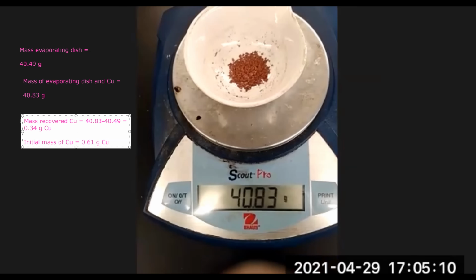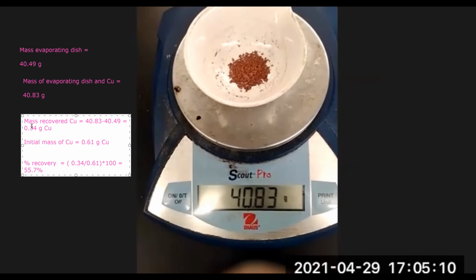So our percent recovery is our mass recovered divided by what we started with times 100, and it's about 55.7%. So obviously we lost half of our product somewhere in the steps.